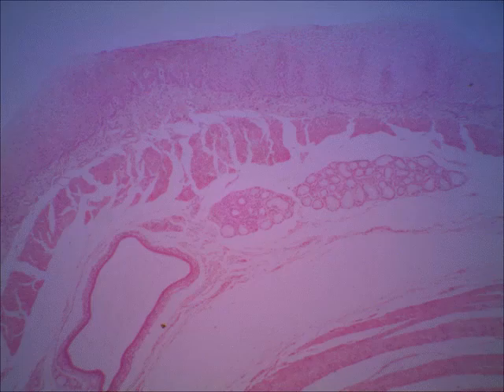All right, on the next few slides, we will be looking at the esophagus. And if you'll notice, on the esophagus, lining it is going to be the non-keratinized stratified squamous epithelium. So you should see it in view now. At the top, I'll just draw a line to go through the width of it. That's the mucosa, what you're seeing with this blue line. There's the mucosa.